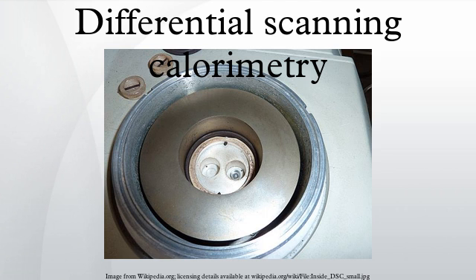This is due to the absorption of heat by the sample as it undergoes the endothermic phase transition from solid to liquid. Likewise, as the sample undergoes exothermic processes, less heat is required to raise the sample temperature. By observing the difference in heat flow between the sample and reference, differential scanning calorimeters are able to measure the amount of heat absorbed or released during such transitions.